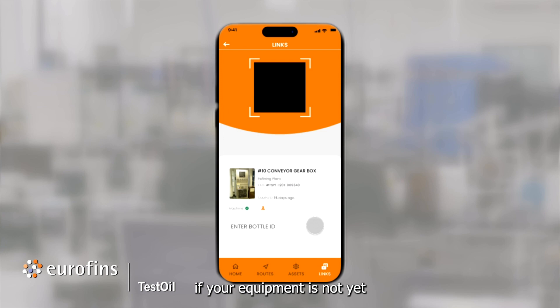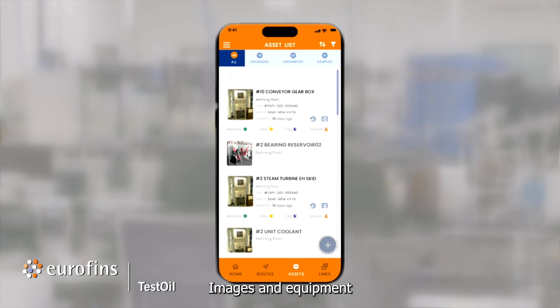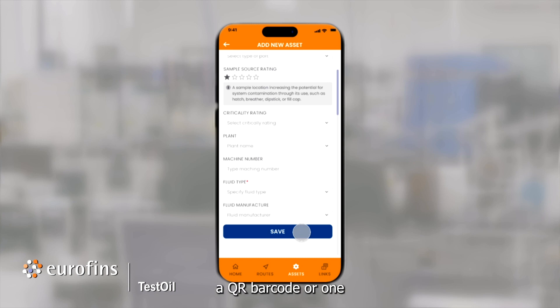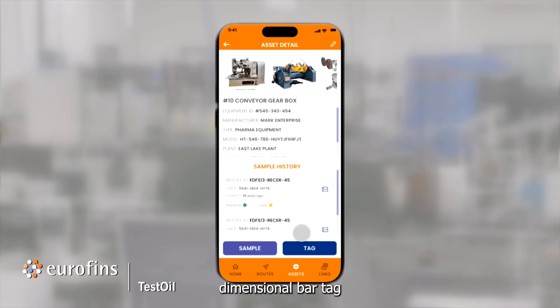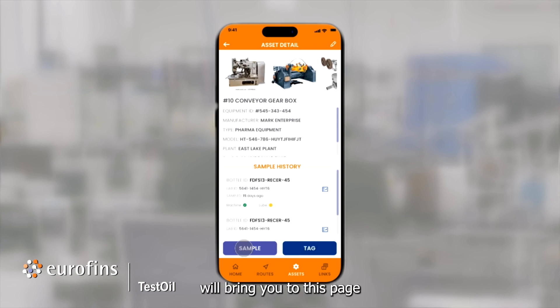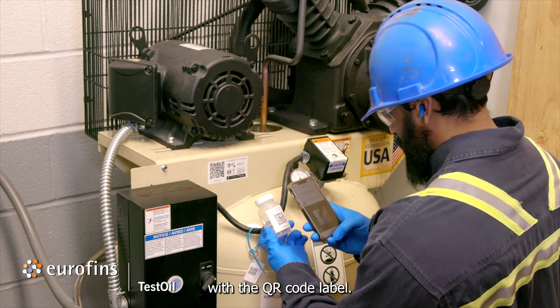And last, if your equipment is not yet registered to your database, it can be added from the Assets page by selecting the blue plus symbol. Images and equipment information can be added here. Simply click Save when complete, and from here, a QR barcode or 1D bar tag can be added by clicking Tag, and the sample can be linked by clicking the Sample button. Any of these methods will bring you to this page, where you can link a sample bottle with the QR code label.